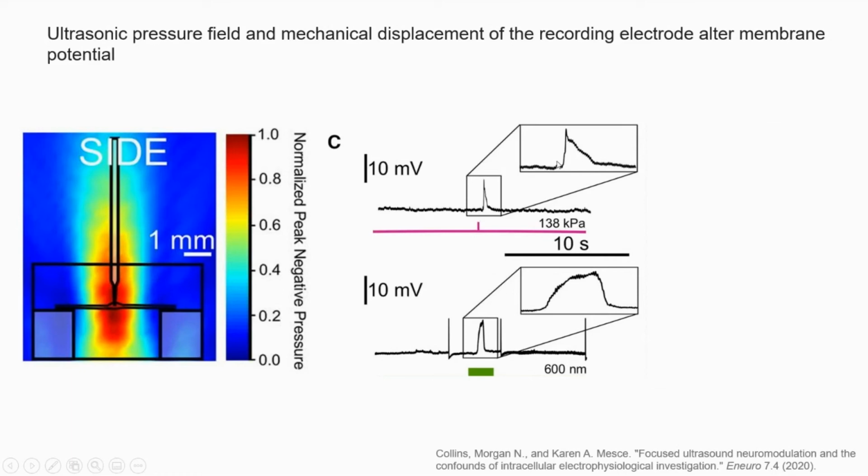You can see that indeed the cell does respond with a deflection in electrical potential. But unfortunately, he was able to do very similar things by simply moving the pipette up and down. And the reason that this is a problem is that if you're hitting this thing with ultrasound, you're going to get some radiation force upwards, and you're actually going to move the membrane around the glass electrode. So you're going to have an effect that looks a lot like just moving the pipette up and down. And now the question becomes, is this because of neuromodulation, or is it because the pipette is simply moving relative to the prep?